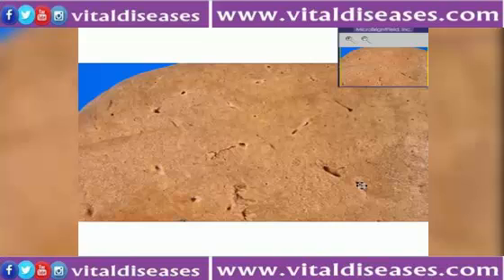If some of these big veins looked like they were all by themselves with no green goo coming from them, those were probably hepatic veins. Generally the hepatic veins are a little bit bigger. But whenever you have something like this, as demonstrated by the arrow, that has a lot of connective tissue around it and maybe another structure, that's more likely to be a portal vein. Otherwise, it's just a guessing game.